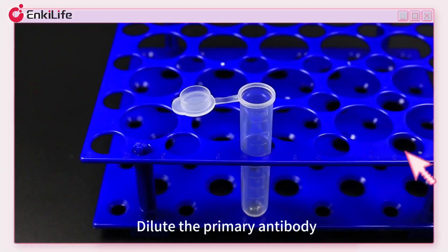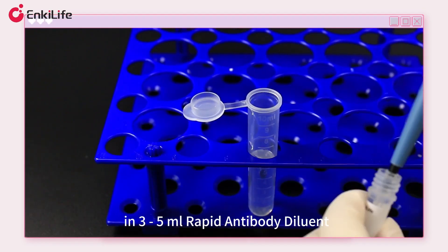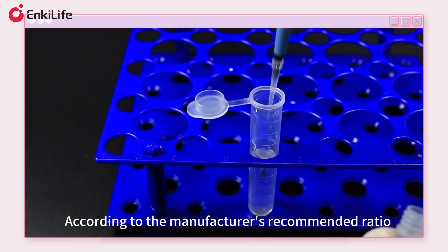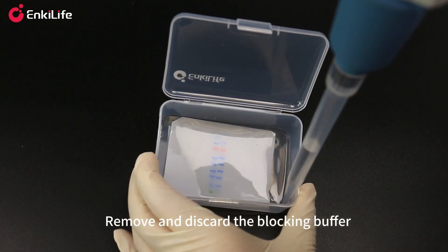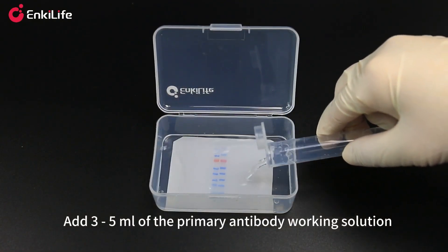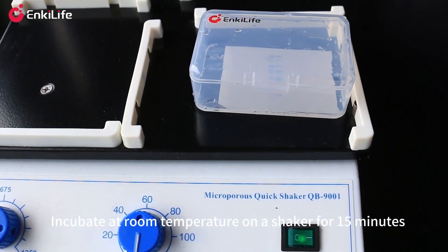Dilute the primary antibody in 3 to 5 milliliters of rapid antibody diluent according to the manufacturer's recommended ratio. Remove and discard the blocking buffer, add 3 to 5 milliliters of the primary antibody working solution, and incubate at room temperature on a shaker for 15 minutes.